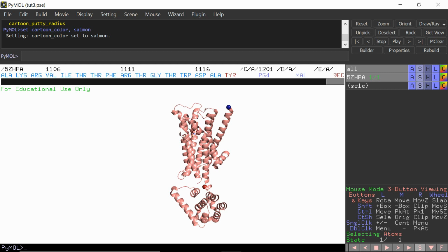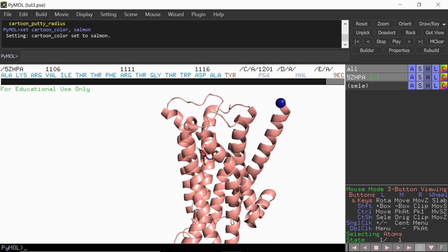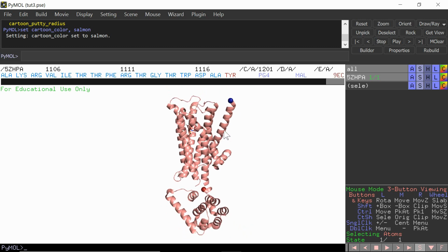In this instance, we're using a lack of contrast, meaning the colors we've chosen are analogous. Although you can still clearly distinguish the ligand, the colors are of a very similar shade, although different levels of brightness, so that neither the receptor nor the ligand are highlighted. This is very useful if you're trying to emphasize the overall structure of a protein with the ligand bound in it, not necessarily having an emphasis on either the ligand or the receptor itself.